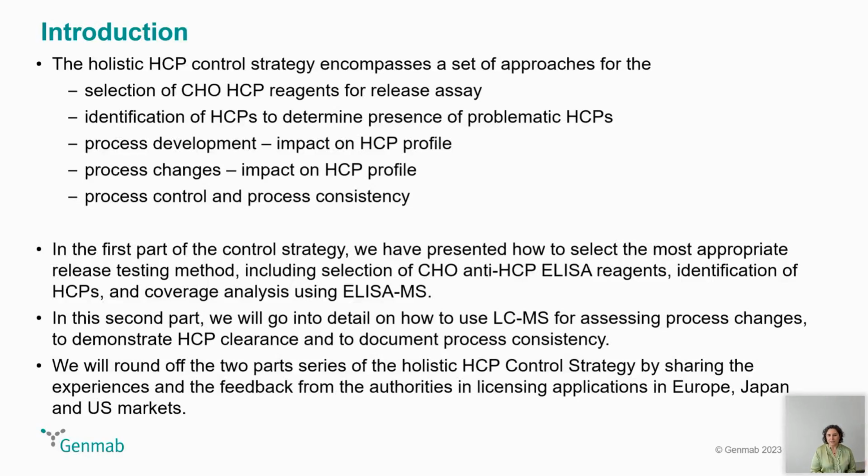So probably you already heard my colleague Søren give the first part of the presentation, a good presentation on how to select the most appropriate release testing method, including the selection of CHO and anti-HCP ELISA reagents, identification of the HCPs, and coverage analysis using ELISA-MS.